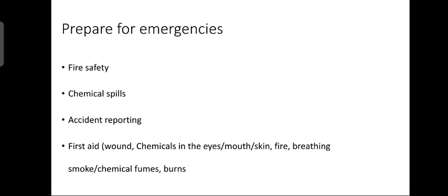They smother the fire by wrapping the victim in the blanket. Tell them stop, drop and roll. Take medical help immediately.